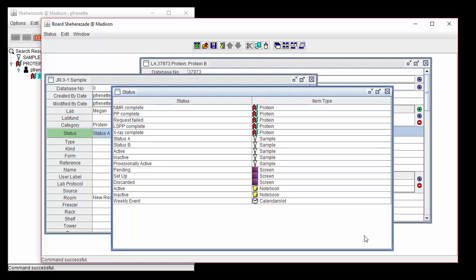Lab masters may import and export lists of status options. Lists must be comma-separated value files or CSV files. This enables the dissemination of resources and simplifies the setup of a new lab. Some other lab resources may also be imported and exported with CSV files. Any pre-existing data that was in the status table will be replaced.